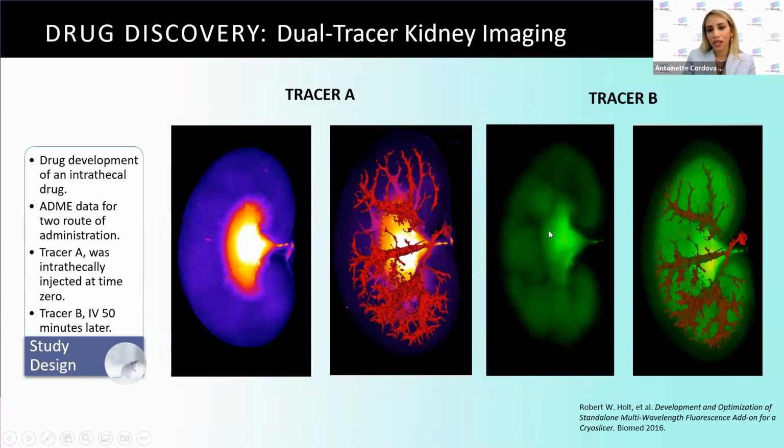But what I wanted to highlight here is the vasculature of the kidney and how it can be highlighted. That is really due to the fact that we also collect high resolution white light imaging. This actually provides the anatomical context of this vasculature in the small kidneys.